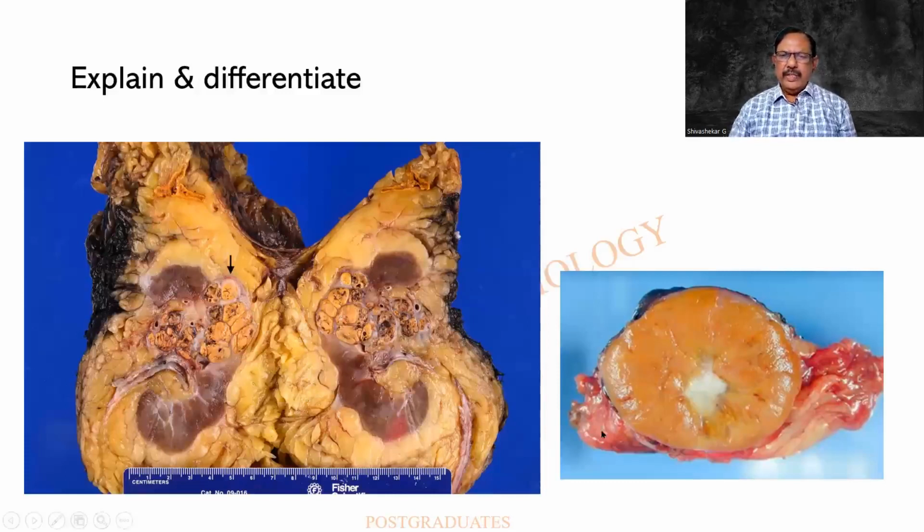For the time being, I will say that this particular tumor is well circumscribed and it has a localized depression in the center. It is somewhat mahogany brown in color and there is a radial pull towards the center of it. Whereas in this one, this is a kidney, this is the pararenal or perirenal fat, and then I find that there are multiple nodules. With this one, what the author says is the yellowish color is clearly in favor of a renal cell carcinoma because of the amount of fat that it can contain.